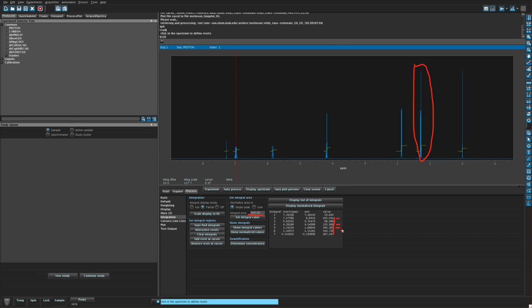As you can see here, we have a variance in numbers. The methyl groups should have an integration value close to 300, but they are actually 340 and 344. This could be because when setting up the parameters of this experiment, we did not wait long enough between transients while recording the data, and this is okay for simple molecules like ethyl trans-crotonate. But for more complicated molecules, it is important to be careful when setting the times between scans.